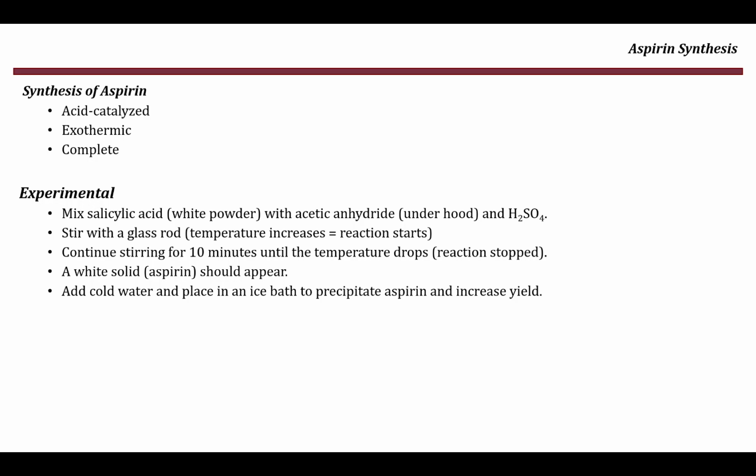So we will add cold water, and then place the whole beaker which contains the reaction mixture in an ice bath, and this is to precipitate aspirin and increase its yield. Because I mentioned in the first slide that aspirin is not soluble in water. That's why adding cold water will help aspirin to precipitate, and this will increase our yield.